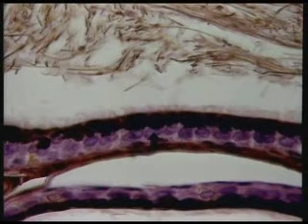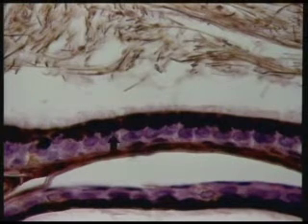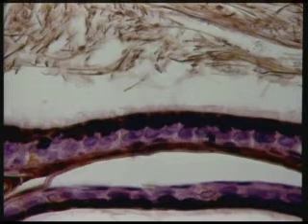And in this section, which has been stained with heavy metals, you see the Golgi apparatus appearing as these large, dense areas. Now, you can't see the membranes for sure, but you can see where the metal has deposited. So this is where the Golgi would be in cells of the epididymis.